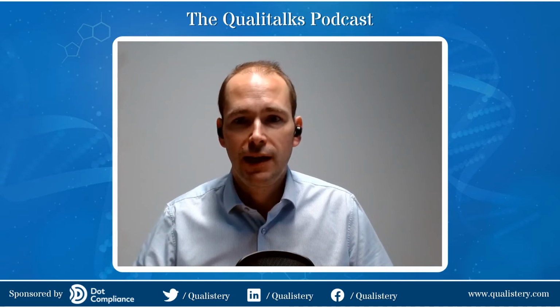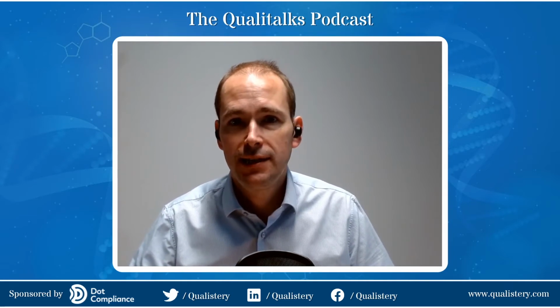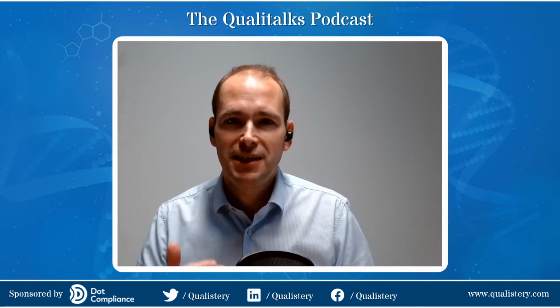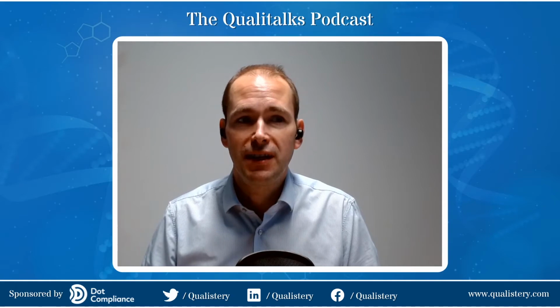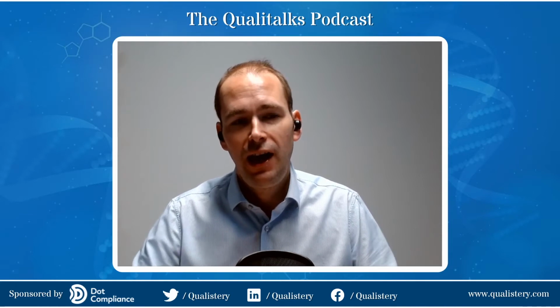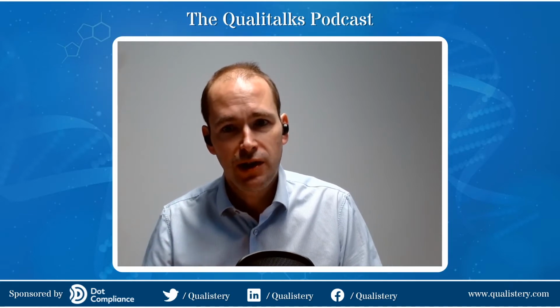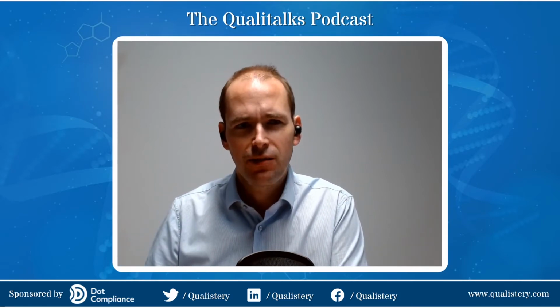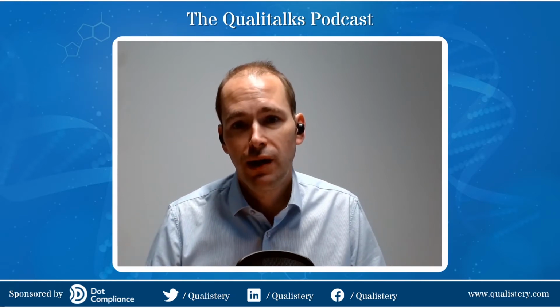So if we have a complex load with lots of thin bore tubing, or we have a tool can that might fit onto an isolator, for example, they need to remove air from that load that's kept inside a tool can that might go through a 0.2 micron filter. So we need to start thinking about the vacuum pump that we're using. We need to think about how we can control the rate at which vacuum pulses happen on the autoclave. We need to think about how we're going to remove any excess moisture, about how we can keep heat within the load during the cooling phase to flash off any potential residual moisture at the end of the cycle. So there's quite a few complex issues that can be addressed with a good URS at the very front.